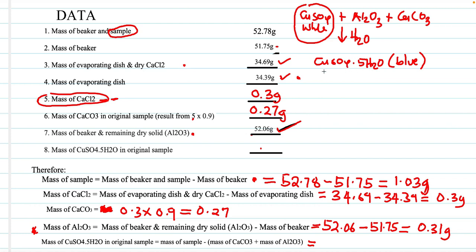Now, when we decanted, we actually moved out the entire mass of this from this mixture. How did I know that? The moment we added water, anytime CuSO4 is present, this will turn blue. So after adding water to this mixture, any blue color you saw was as a result of copper sulfate.